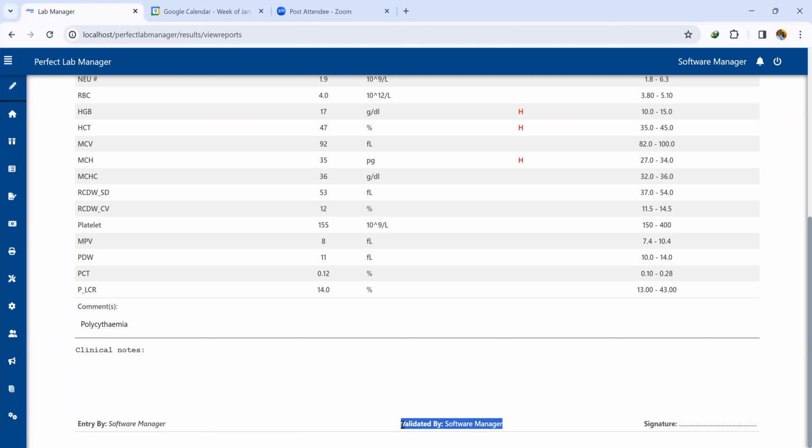So to sound a bit professional, always have one person log in to do the analysis and the results entry, and one person proofreading the results to validate them, so that you have their names appearing on the results. It looks more professional, and you make your work much easier for you.